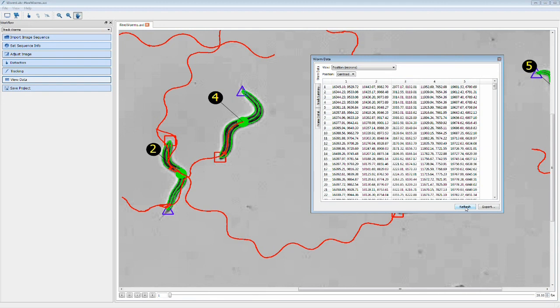Speaking of the tail, Andrew asked a question about what the endpoint of the tail is actually being identified by the algorithm, and we're marking the end of the worm basically at the anus, not the tip of the tail. And so that's why it appears that there is still a small portion of the tail that is not being marked or fit. I think what you'll find is that when you're imaging this, the tail can be very faint and it can kind of come in and out of visibility or contrast. So if you tracked all the way to the end of the tail, you'd have it constantly changing worm length based on how visible the tail was.